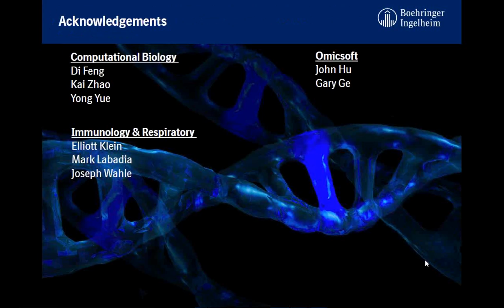So if you really focus on particular subsets, you still want to partially enrich. Let's say I want to remove this confounding cell type, neutrophils, I don't want it, then the remaining cells may be capable. So if you want T cells, it's better to try a preliminary experiment with T cells to see if you can really find what you're looking for. You really want to estimate if it's doable, then you apply it.